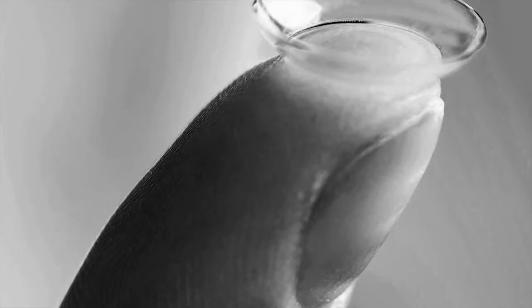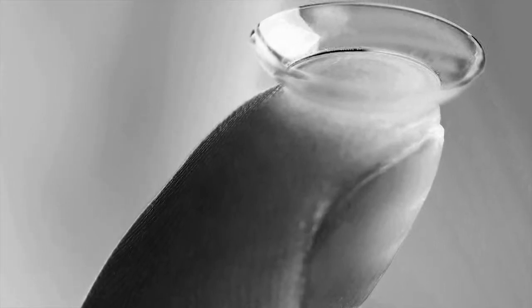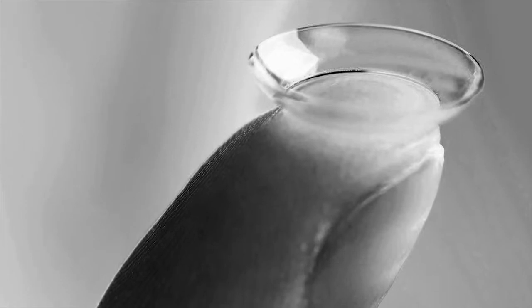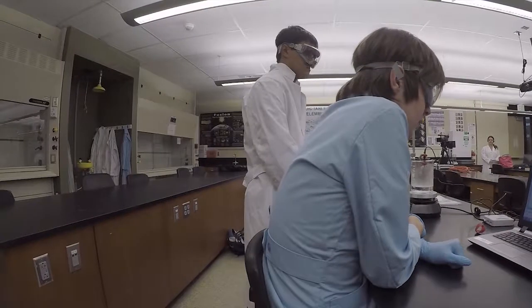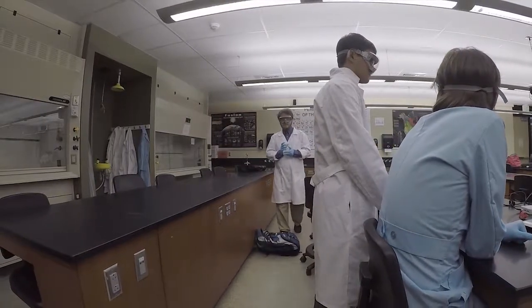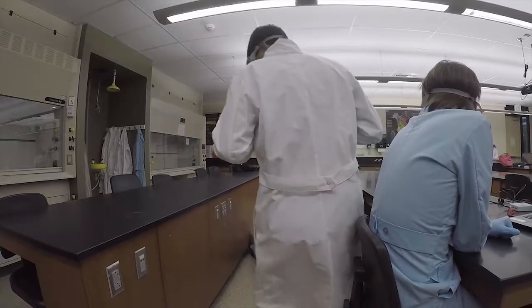If you wear contacts but also have glasses, wear your glasses. By wearing contacts in a lab with corrosive vapors present, the vapors can get in between your eyes and the contact lens, potentially adhering to your eyes. This can cause irreversible damage, even blindness. Keep backpacks and other personal items away from your experiments and out of the walkways. This helps to prevent slips, trips, and falls.